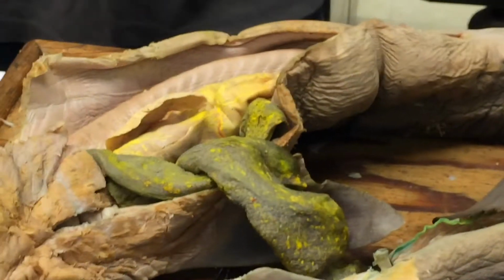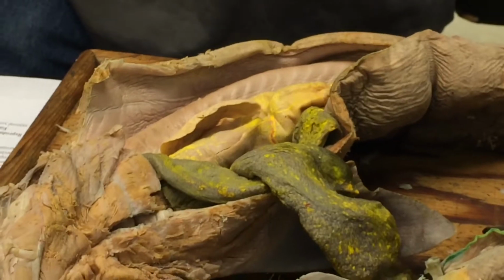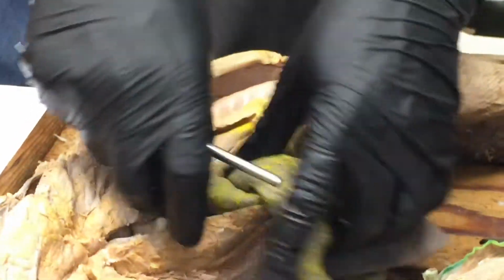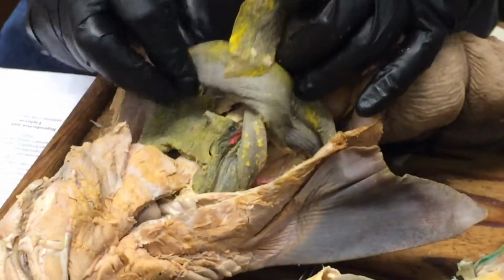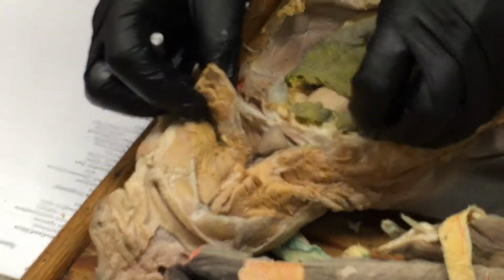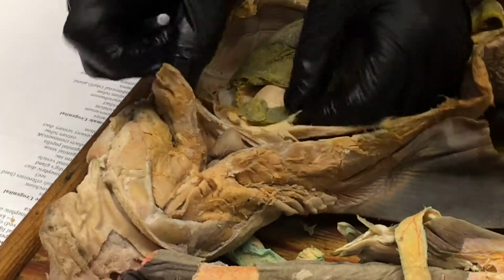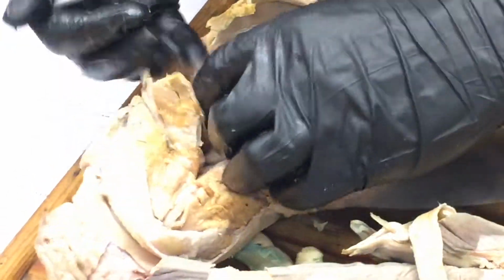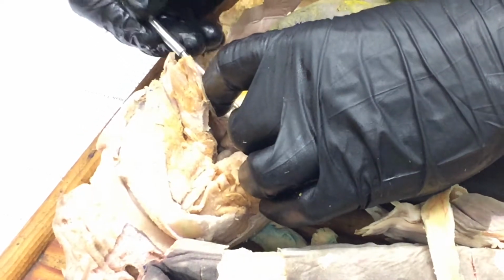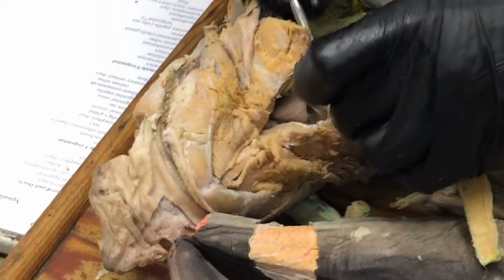What, you skipped the ostium tubae. Oh, I was wondering when I was going to get to that. It's tough to find, but I think we can do it on this shark actually fairly nicely. Oh, very nicely. Look at that. Beautiful. Let's see if I can just get a probe in there.